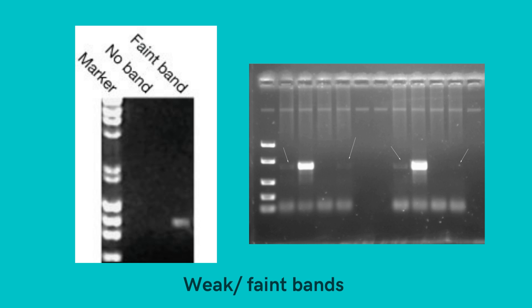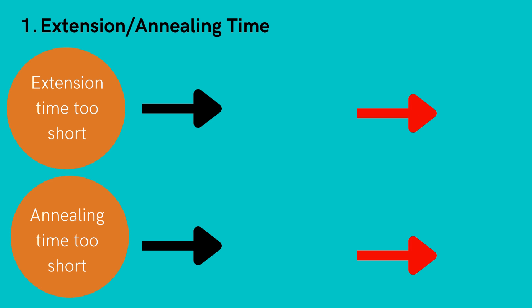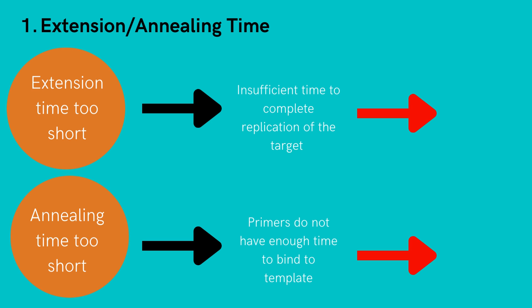As depicted here, these bands are not very visible and therefore cannot be deemed significant when analyzing the results of the PCR. The extension time of the PCR reaction might be too short, resulting in an insufficient amount of time to complete the replication of the target. This will lead to failure to produce any amplification products or might result in nonspecific short products. On the contrary, if extension time is too long, this can lead to smeared bands. If annealing time is too short, primers do not have enough time to bind to template strands, also resulting in nonspecific bands. The rule of thumb for extension time is using a time of one minute per kilobase. When the temperature is below 68 degrees Celsius, a longer extension time is required.